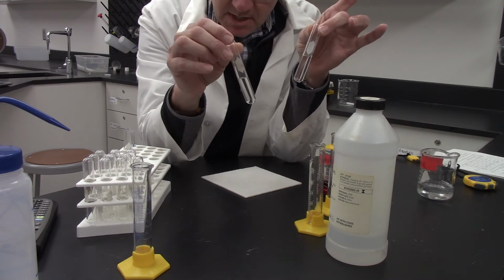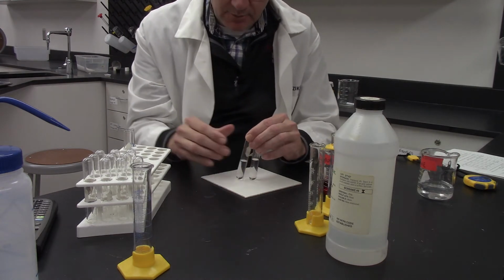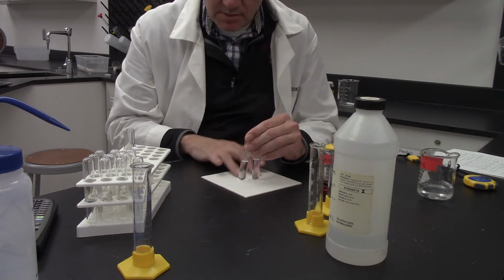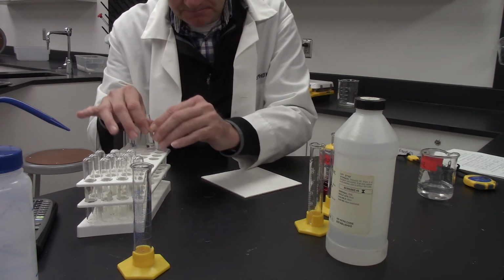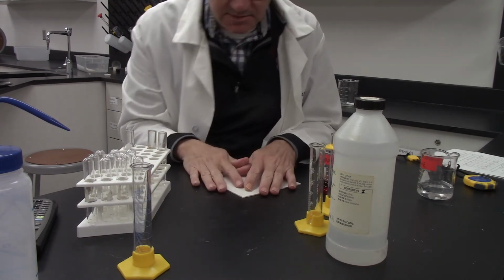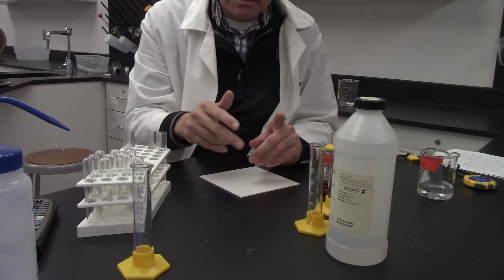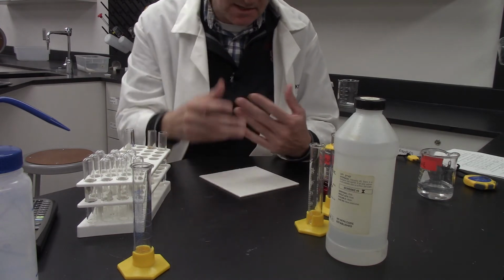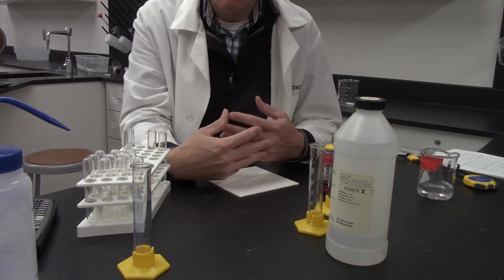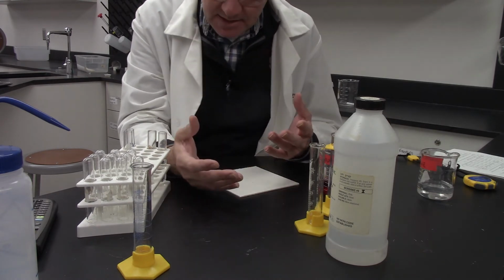We're going to measure how long it takes to do this. On the data table, I'm going to give you the reaction time for this. That's going to be the first part of the lab. I'm going to run all those and I'll get you that data. The second part of the lab is that we're going to come up with our own combination. Ideally you would be in the lab and you would pick your own set of combinations. I did that for you.